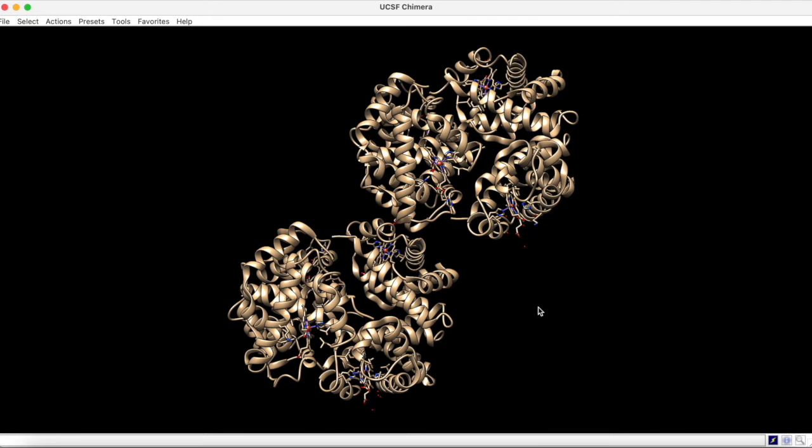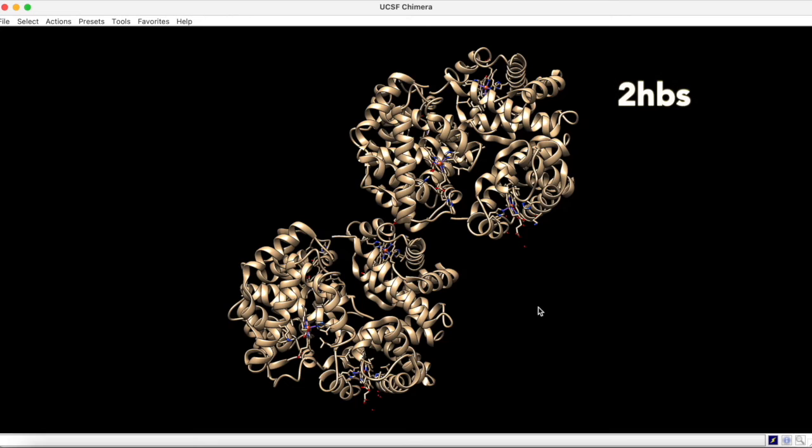Here we have a hemoglobin structure with the PDBID 2HBS. This structure is a mutant which is known to cause sickle cell disease.